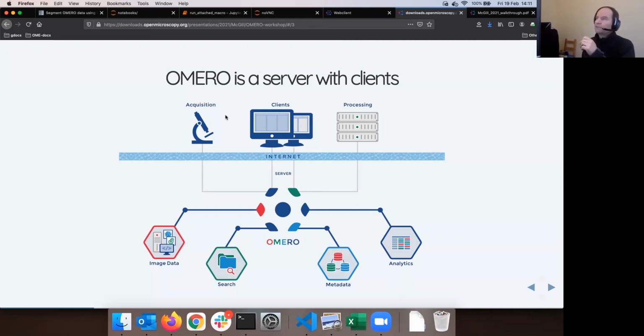So Omero, as we said, is a software which is an image management software. And the main point about Omero technically is that you have to kind of realize that the images, all the images you will work with in Omero are on the Omero server. This is not local to where you are. This is somewhere else, okay? And this is, in our case, the case as well. This is the first thing.